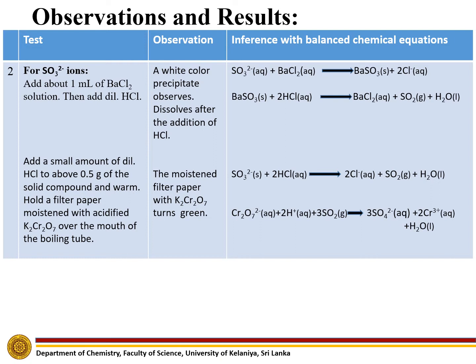In the second part of the experiment, when we add hydrochloric acid to the given powder, a gas is evolved, and it is sulfur dioxide.